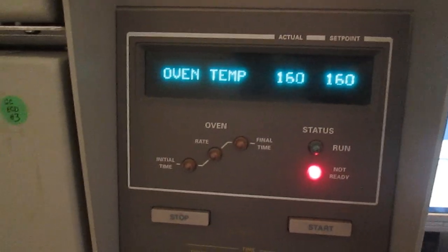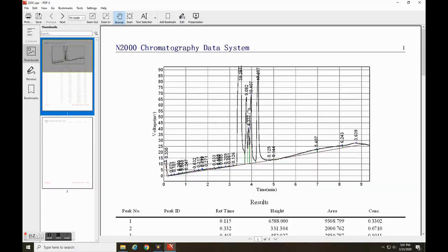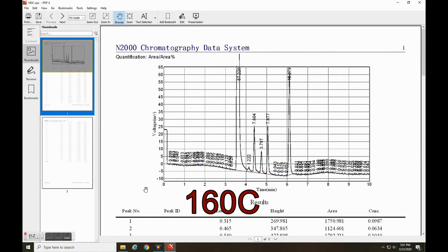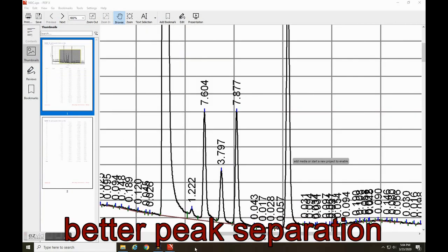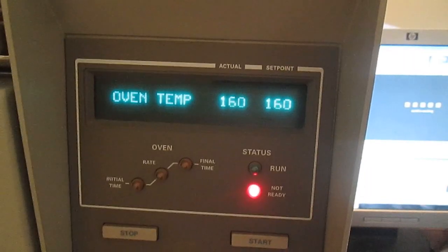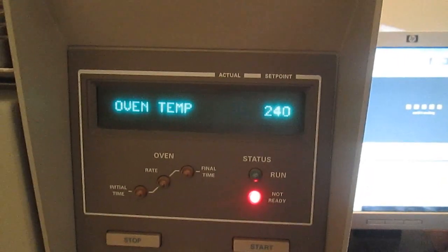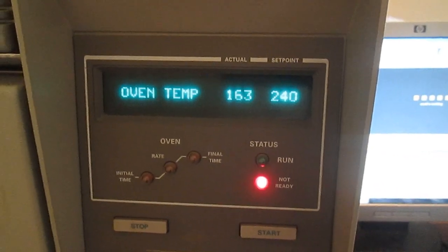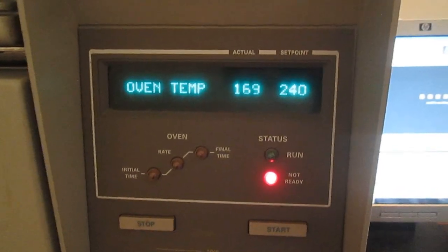I'd like to bring your attention to the effect of temperature on the resolution. Here is a full analyte mix I prepared and ran at 220 degrees Celsius, and here it is at 160. Here's a zoomed-in view so you can see better. The chromatograph can ramp the temperature depending on how volatile the analytes of interest are, so lower temperatures give better results for volatile molecules like acetone, but higher temperatures would be best for things like naphthalene.